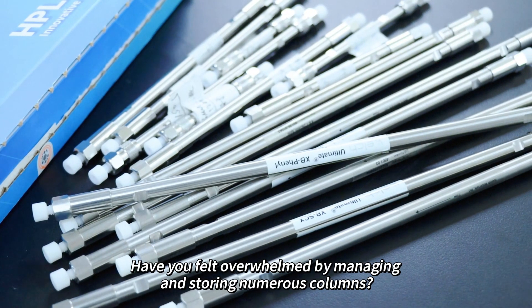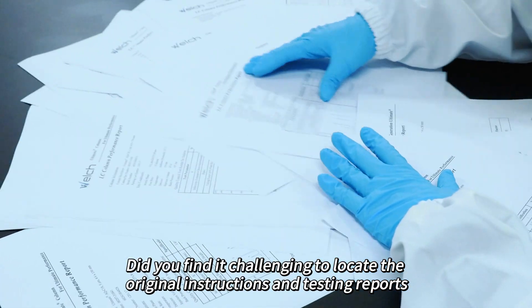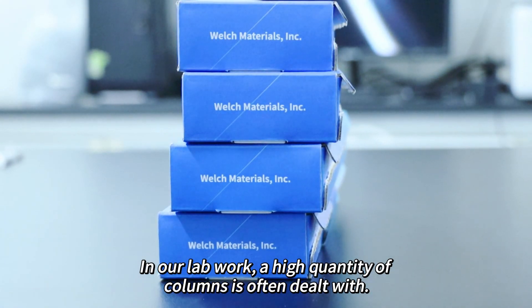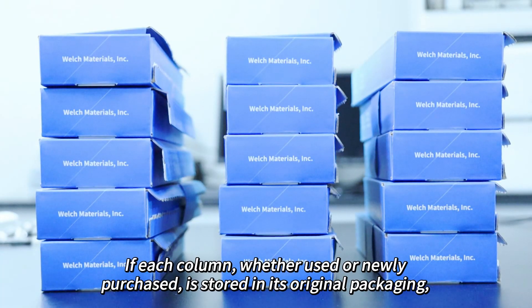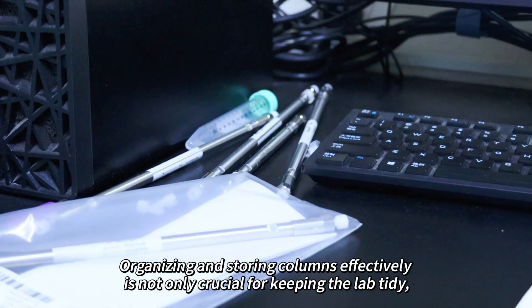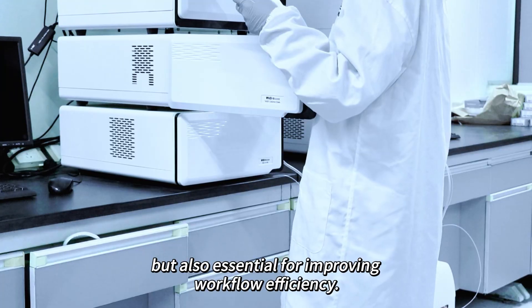Have you felt overwhelmed by managing and storing numerous columns? Did you find it challenging to locate the original instructions and testing reports every time you switch columns? In our lab work, a high quantity of columns is often dealt with. If each column, whether used or newly purchased, is stored in its original packaging, it can take up a lot of space. Organizing and storing columns effectively is not only crucial for keeping the lab tidy, but also essential for improving workflow efficiency.